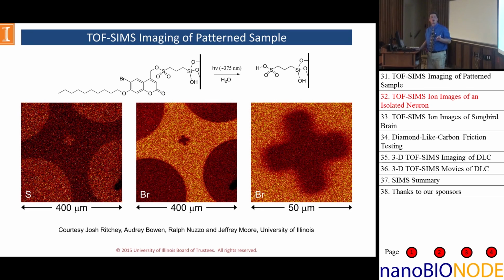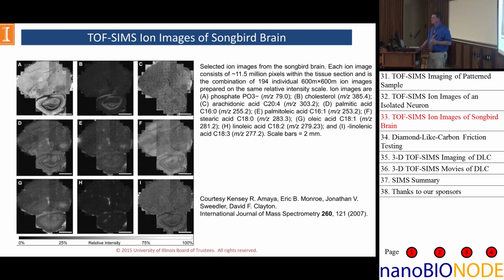That is what they call a cracking pattern, so you can identify it. This mass here is vitamin E, and this one here is a vitamin E fragment. The lateral imaging helped to determine the cracking patterns. They found that if you starve the cells of vitamin E, it tended to localize here at the part where the cell connects with what they call the process, which is where it reaches out to talk to other cells. So they found out that vitamin E was very important for communication between the cells. That was some work that was done with the TOF-SIMS.